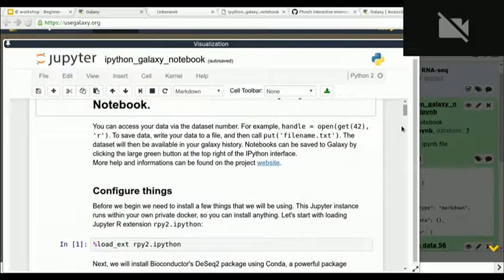There are also some rough edges. This is very complicated, so there are some rough edges. For example, the half-life of these notebooks, the half-life of containers, is 2 hours. So save it. They just die. And we haven't figured it out yet. So it's improving every month.